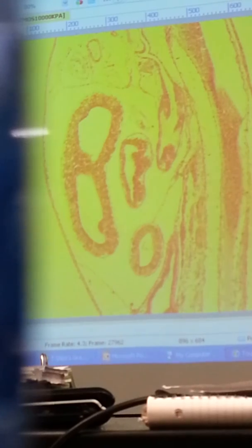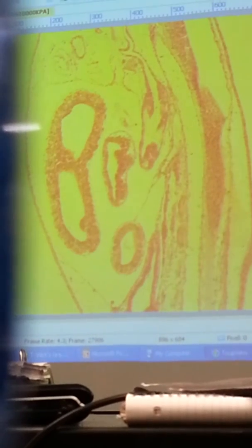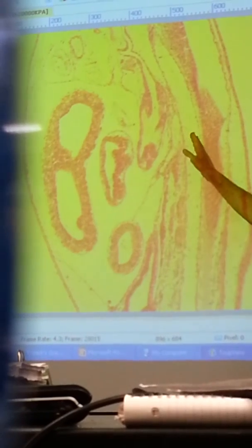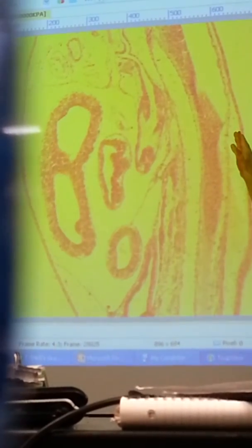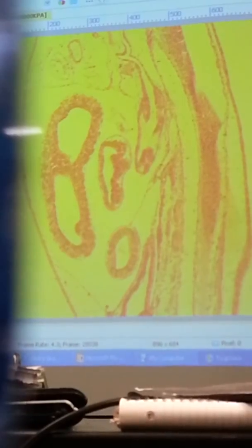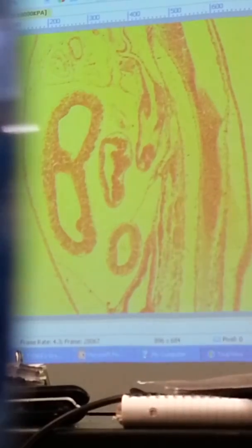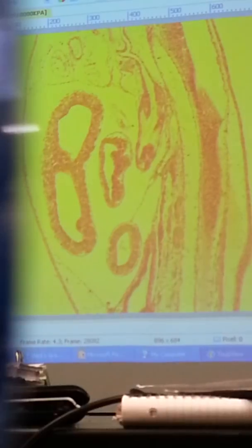What's on the outside of it? Well, okay, so if here's notochord, here's spinal cord, and then here would be what? Muscle or little fin-like things that project off of a tadpole's back. There is a bit of a fin on the back of a tadpole, and you'll see that in cross-section. You don't see it quite so clearly here. Now, I do want to get out to an edge, and I know that this is probably driving you guys crazy by this time. This kind of slide work, I know, is hard.